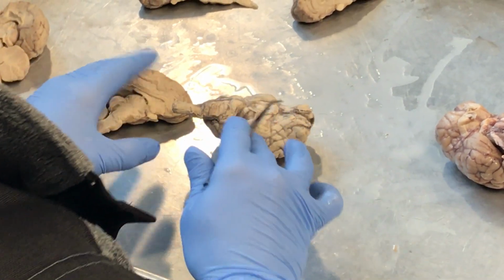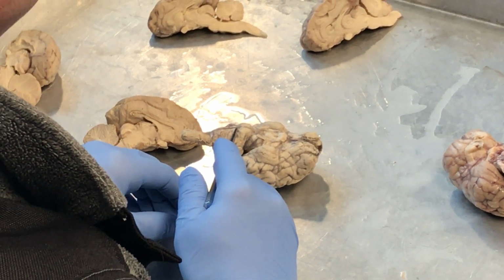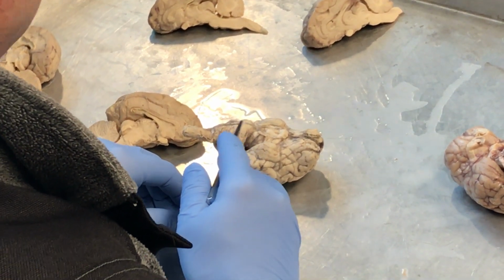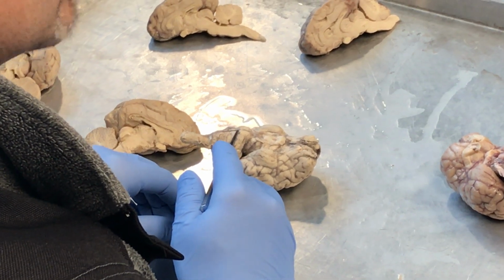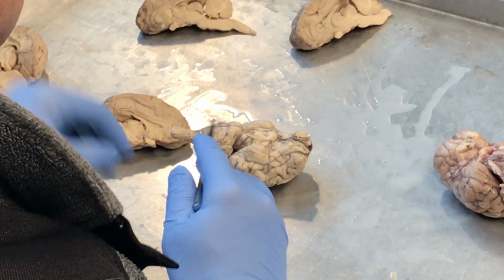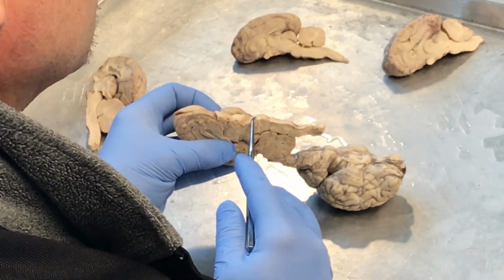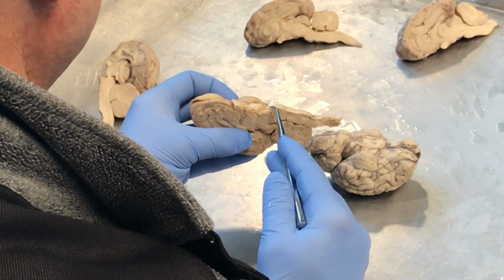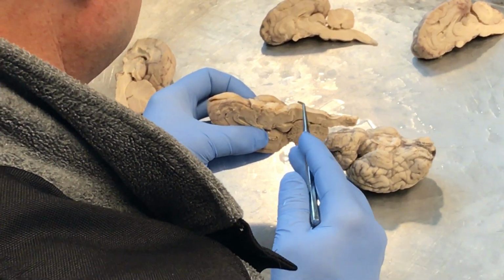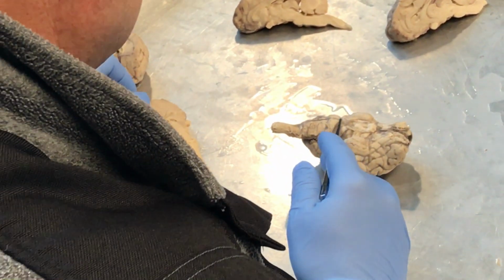See, when the brain's laying like this, the highest part of the brain stem, see that area right there, that bulge? Let's get our bearings. That bulge right there is called the pons. It's the highest part, laying on its back. Same thing if we lay this one on its back. The highest part right there is the pons. Pons, by the way, means bridge. Okay, so the pons is in the middle.